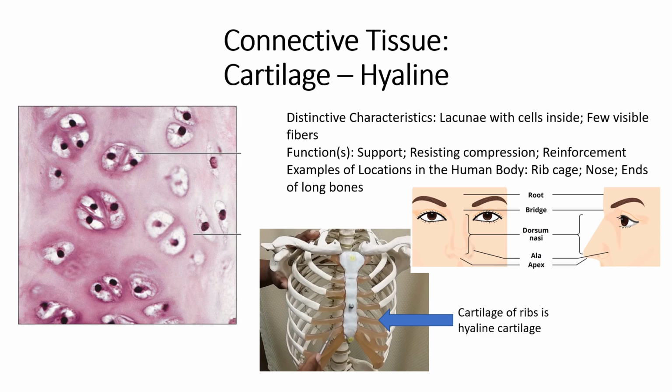The dark coloration that you see here is the nucleus, but that large white structure surrounding that is not the cell. So the dark spots that you see are nuclei inside of cells, right? But the larger white structures surrounding that are structures known as lacunae.